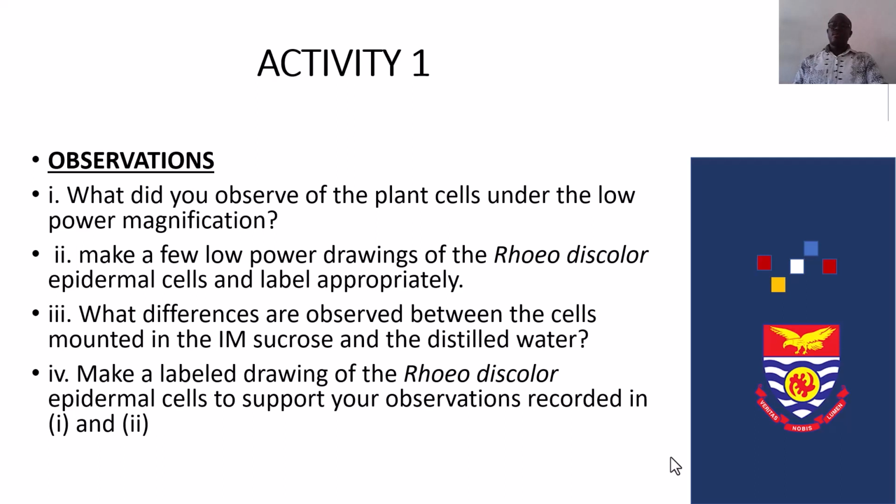Observations. What did you observe of the plant cells under low power magnification? Make a few low power drawings of the Rhoeo discolor epidermal cells and label appropriately. What differences are observed between the cells mounted in the 1 molar sucrose and the distilled water?